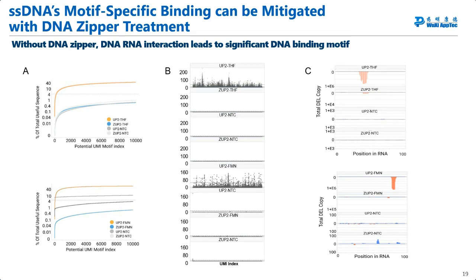We used riboswitches from different species and applied different affinity metrics to investigate the background effect. These RNAs were folded and screened in parallel with warheadless single-strand DNA DEL and the warheadless zipper DNA DEL. The sequencing data was subject to DNA binding motif analysis.